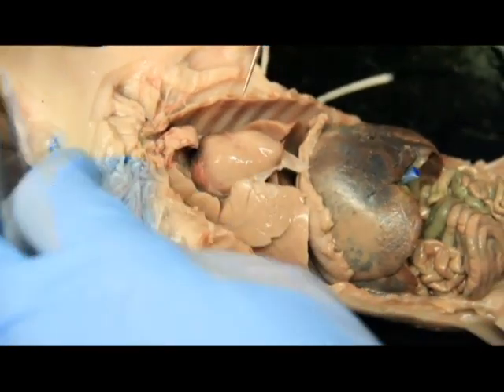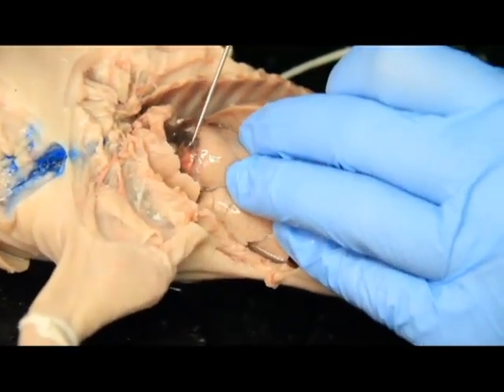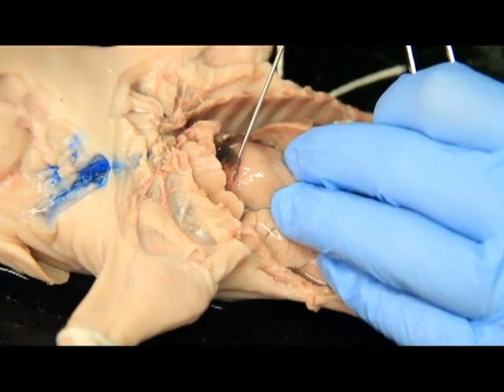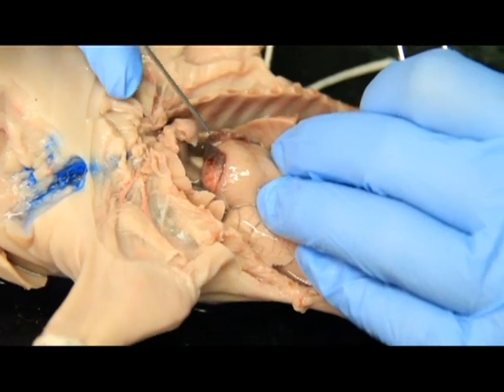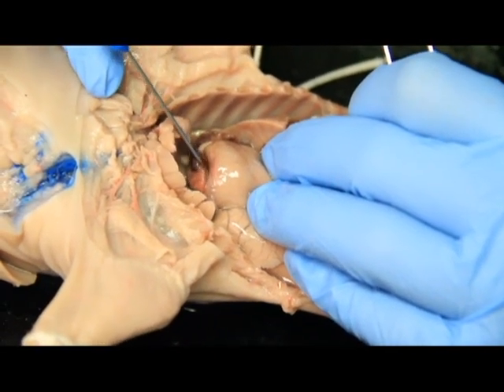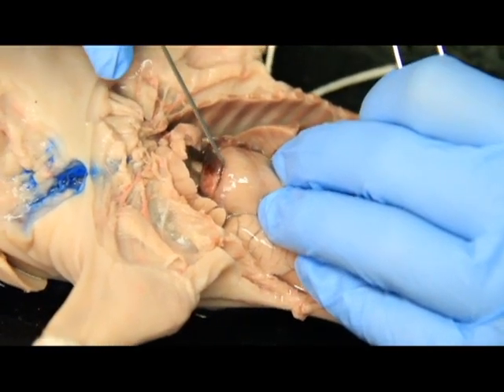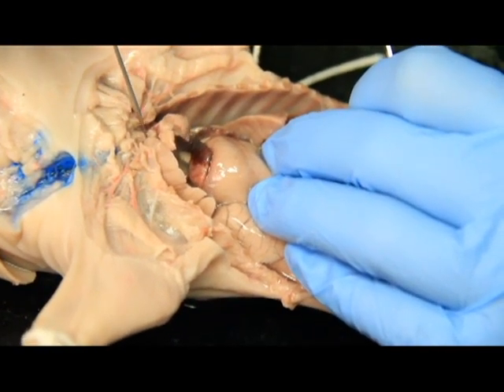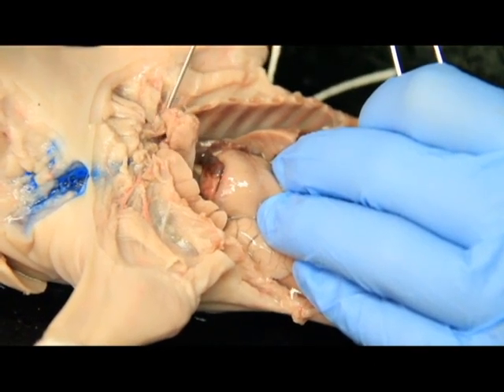Okay. So once we do that and we pull the heart down, the first thing you notice is these dark flaps on either side of the heart. These are the auricles. And again, we're never going to ask you the difference between the right and the left auricle. We're not going to worry about that. But you should know that underneath the pericardium are the auricles, while above the pericardium is this thymus. So again, we're going to keep this thymus back here.